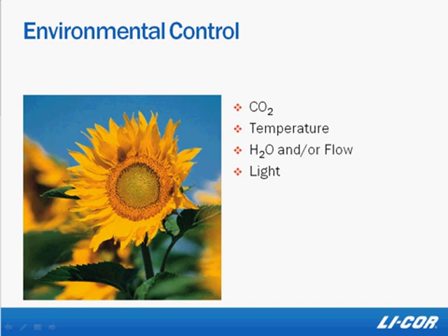We're going to use a constant water mole fraction, so the instrument adjusts the flow rate for us for this response curve as well, ensuring that our plant's stomatal response isn't influenced by changing water levels. And for light, we're going to use a constant saturating PAR level, which is going to be easiest and fastest if you use a supplemental light source. But it is possible to do it with just the sun.